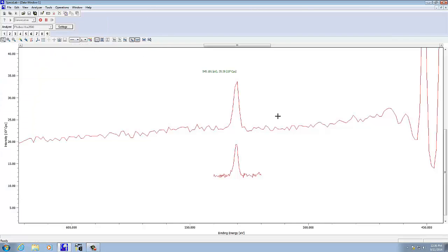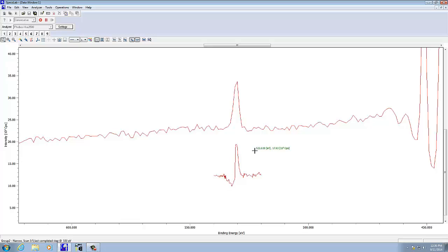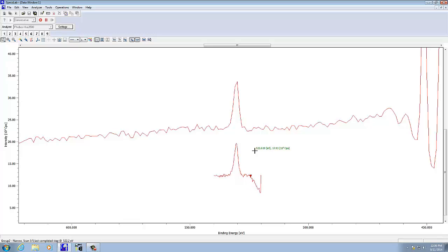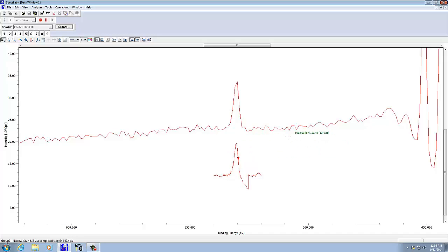It will now add 3 to the previous scans. Now it's going to add 3 more scans onto those 2 for a total of 5, and what we should see is that the signal-to-noise improves, and the plot smooths out. The number of scans does depend on what type of data you're looking for. In some cases, you might need 50 scans, in some cases, 5 is enough, just depends on what you're trying to do.